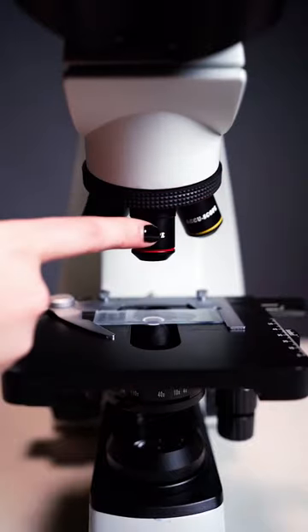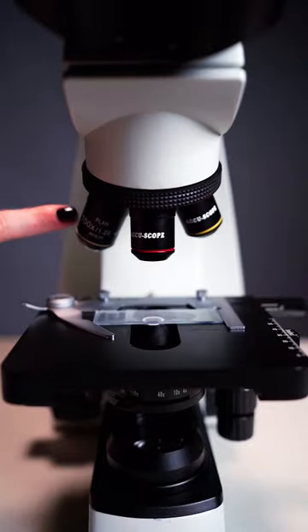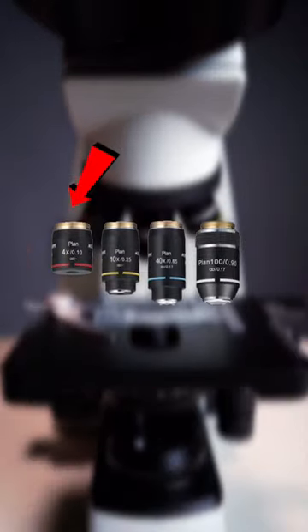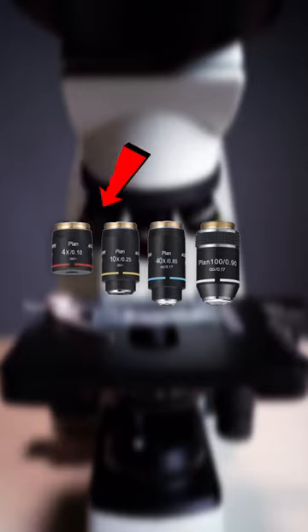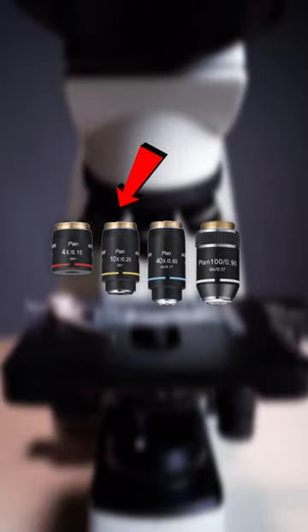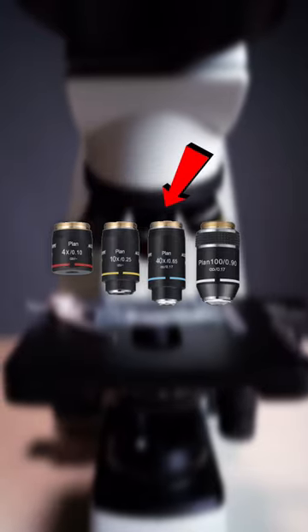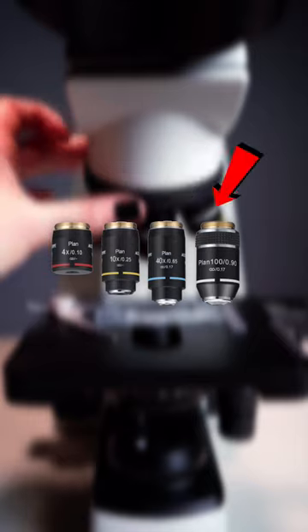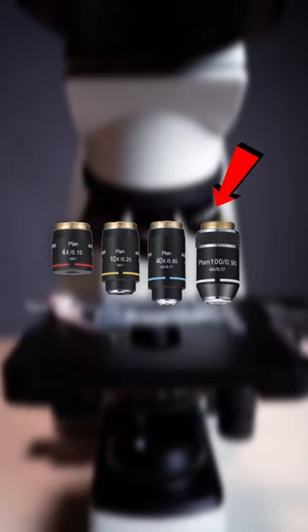The typical microscope has four different objective lenses: a scanning objective or 4x, a low power objective or 10x, a high power objective or 40x, and an oil immersion objective or 100x.